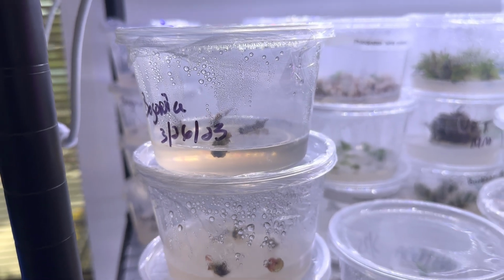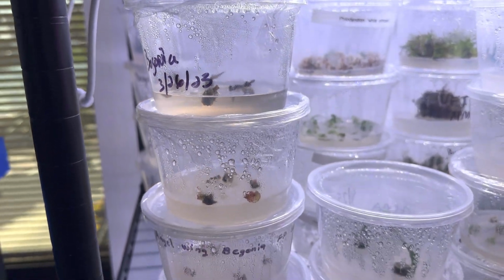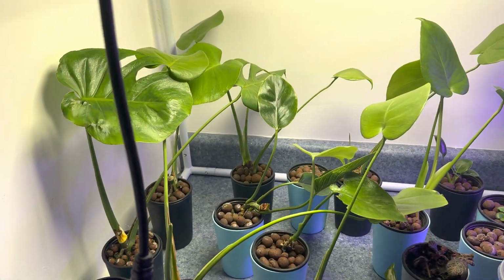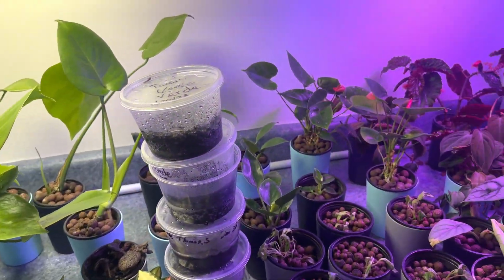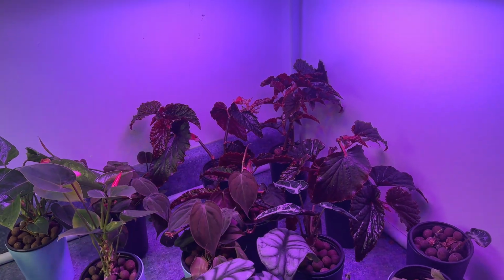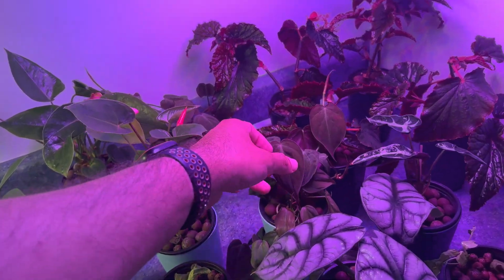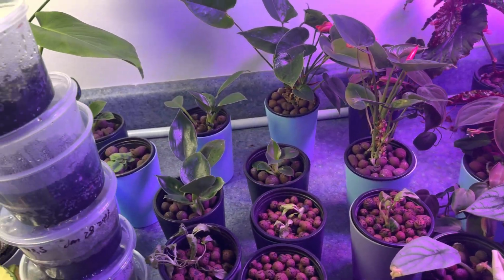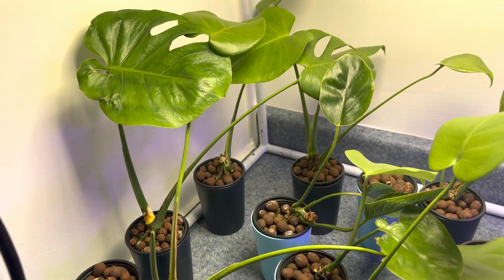We are going to do the sterilization all here in the lab, and we are going to do everything in tissue culture. Like, see, these are some of the plants that we have taken into tissue culture. So we have a couple of begonias. This is the Philodendron micans that I showed you just earlier. And these are the monsteras. So these are the monsteras that we cut.